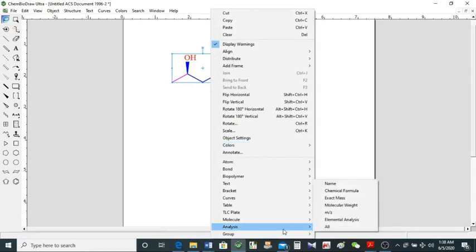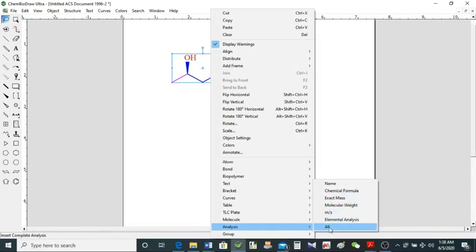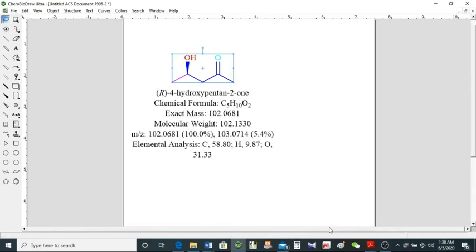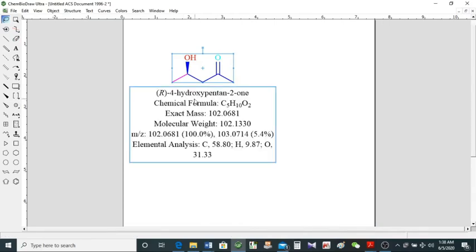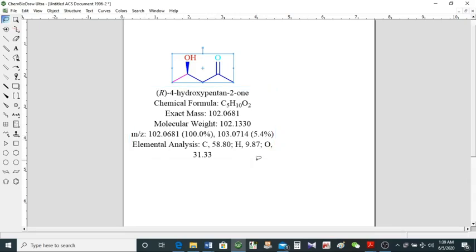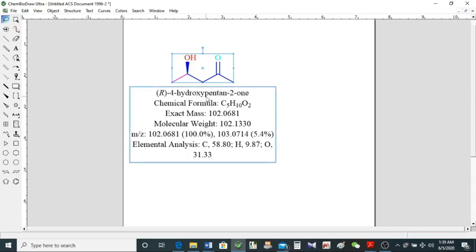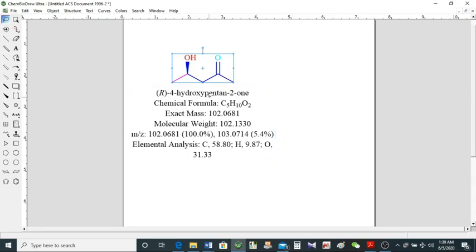What I wanted to show you is the Analysis tool. You can add the name of the molecule, the chemical formula, the exact mass, and the molecular weight. If you click All, you get everything: the name with stereochemistry, the chemical formula, exact mass, molecular weight, empirical formula, and even elemental analysis. These are all the pieces of information you need about a molecule.